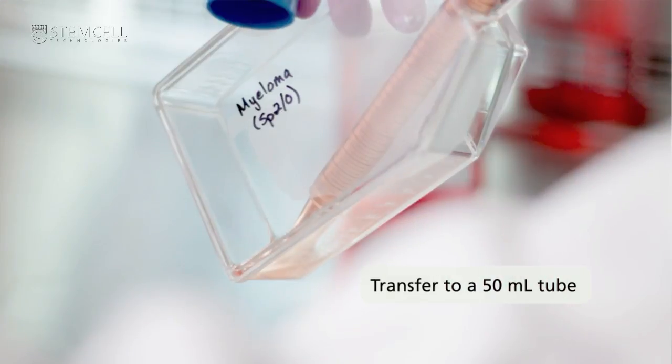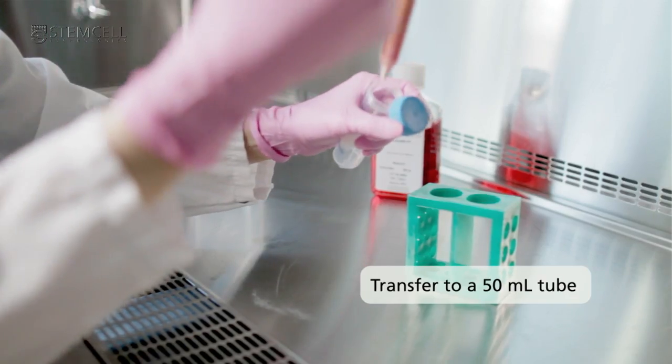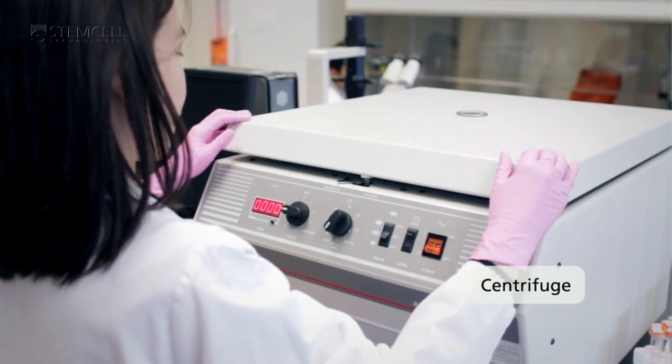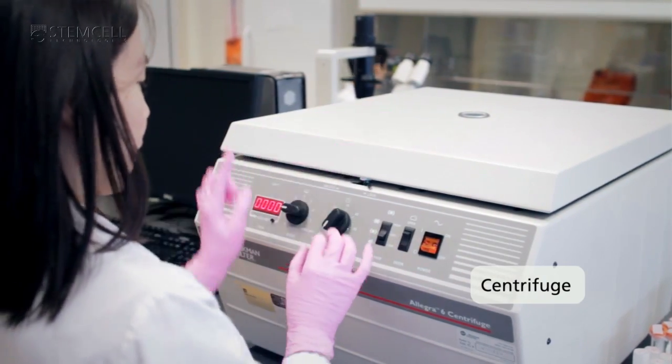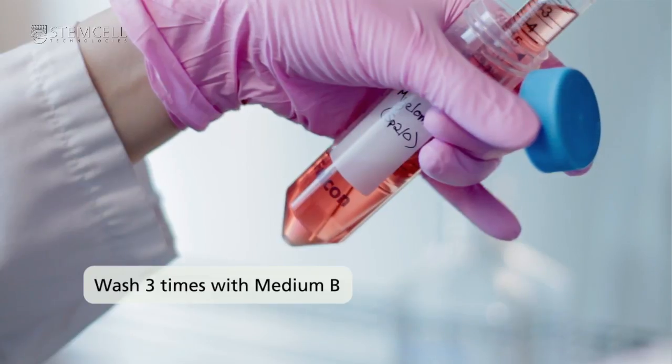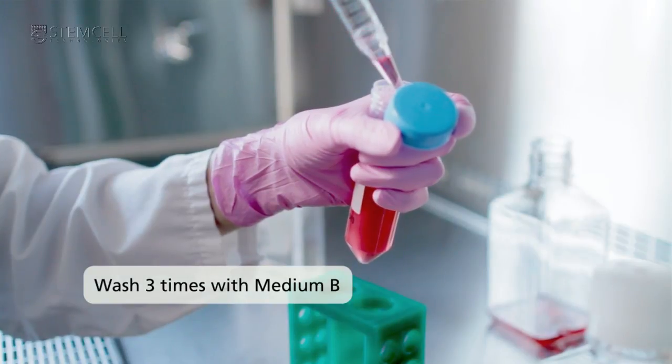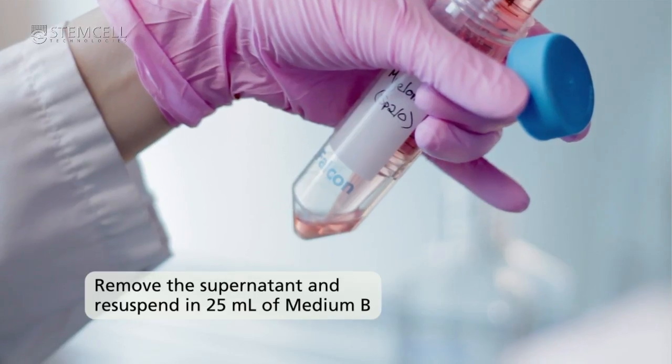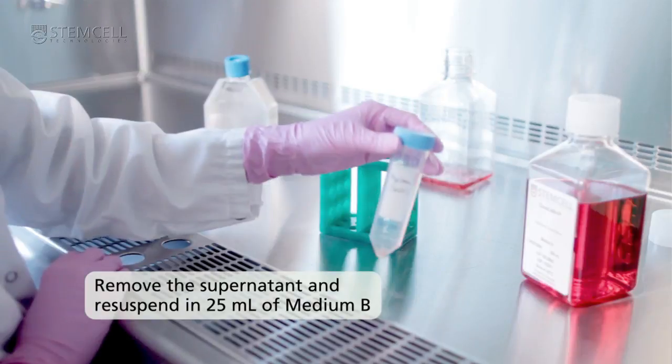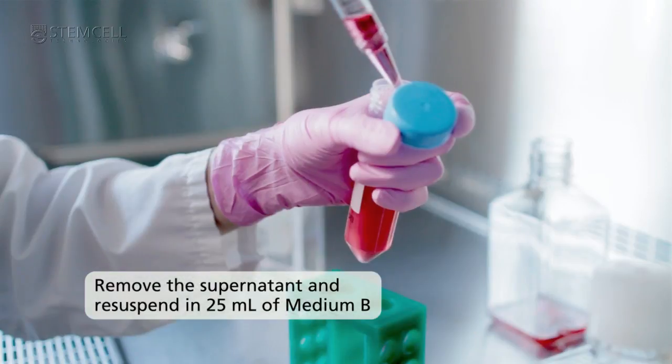Wash three times with medium B. Remove the supernatant by pipette and re-suspend the pellet in 25 mils of medium B.